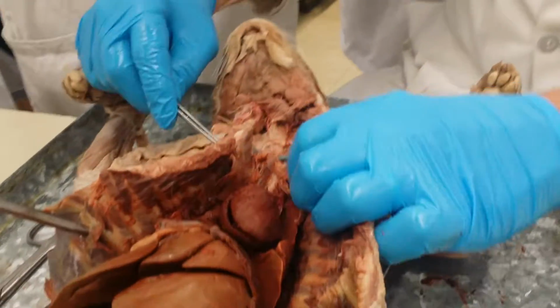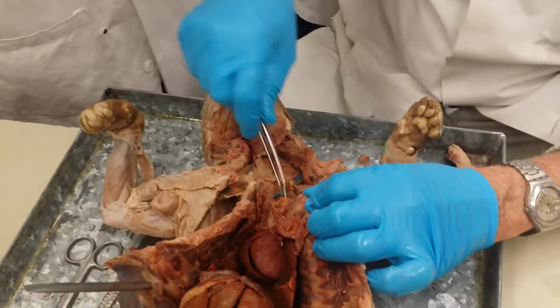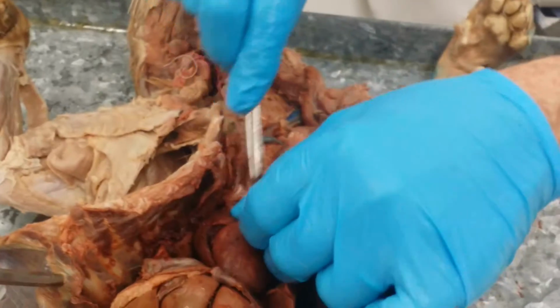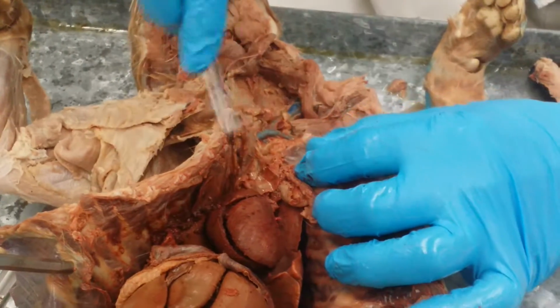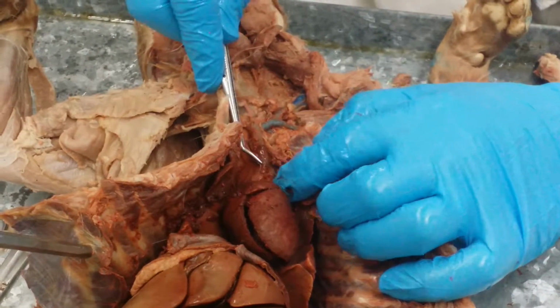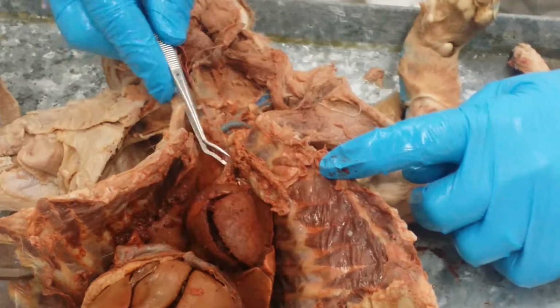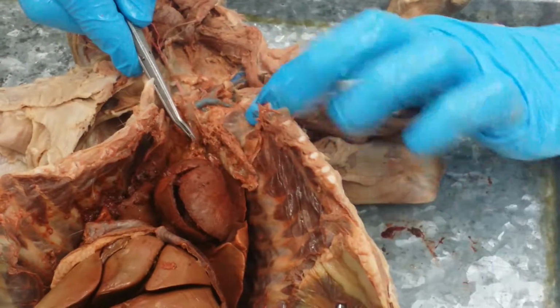The venous system is fairly easy to do at this point because it's on the surface. Let's go back and look at a couple of things. We started at the heart and we worked our way out this way. The major vessel from the arms, head, and neck emptying into the heart is the superior vena cava, or anterior vena cava, whichever one you want to use in here.